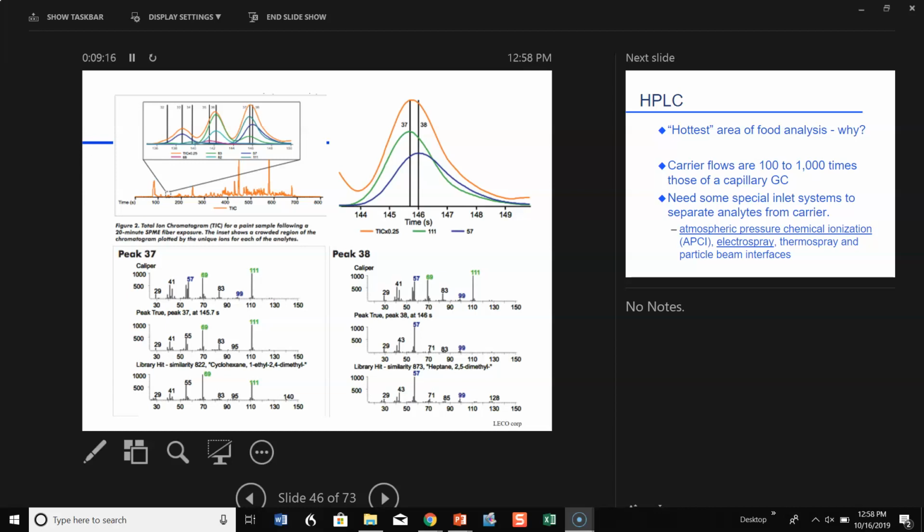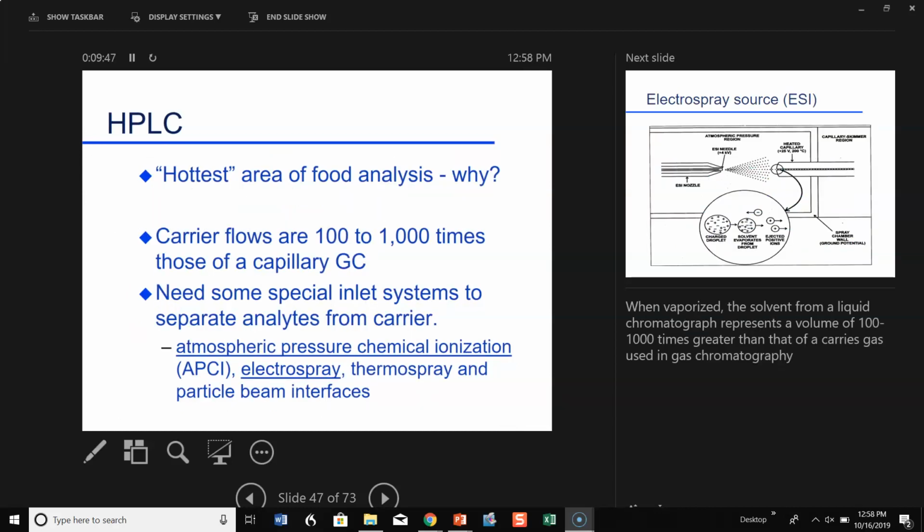It's really a benefit. Because, at that point, you don't need to separate components perfectly. If you can separate them by milliseconds, the mass spectrometer will measure them independently. And so it even makes separation easier because I don't need perfect separation. I don't need to separate it by that much. Here's a peak, here's a peak. They could be under one shell, but just have to move milliseconds apart. So it's a tremendously powerful technique in a sense.